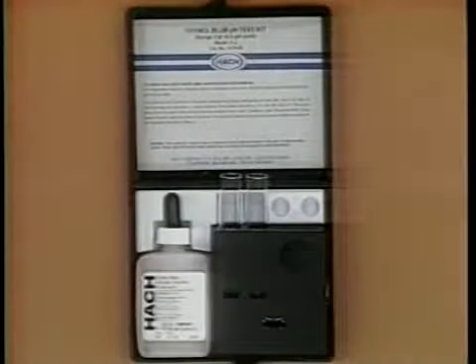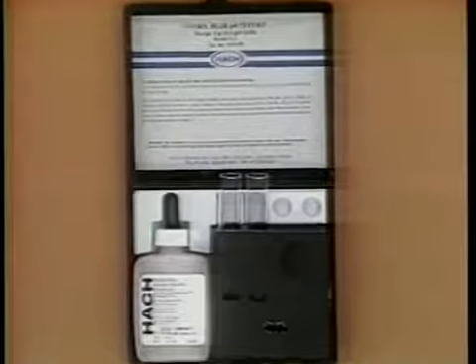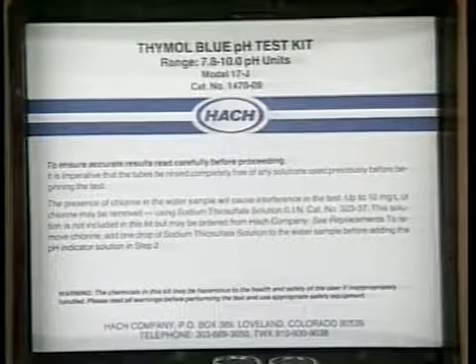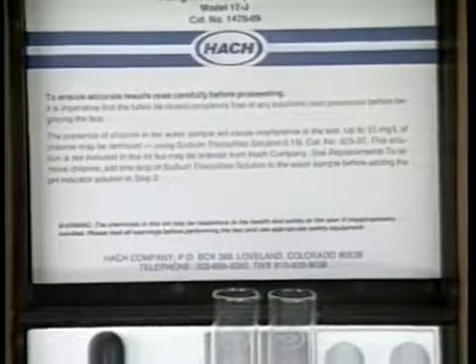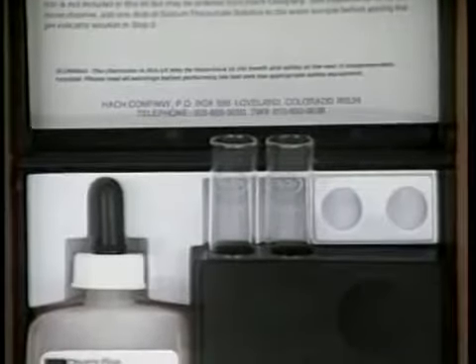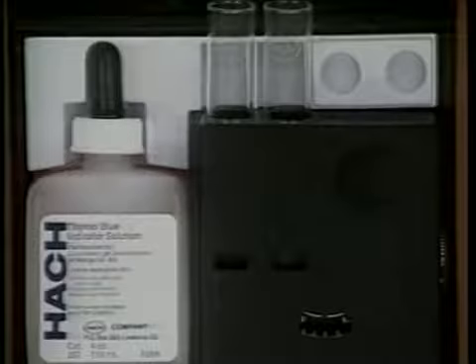pH may also be measured using a narrow range method. The smaller range allows for more accuracy. There are several narrow range kits available, but the most common is the Thymol Blue test, which measures pH values between 7.8 and 10, which are the most common pHs in pond water. Narrow-range test kits are not included in most large kits and must be purchased separately.